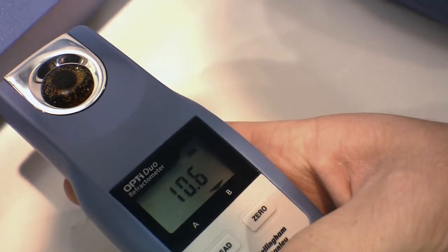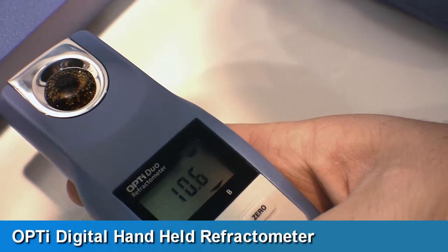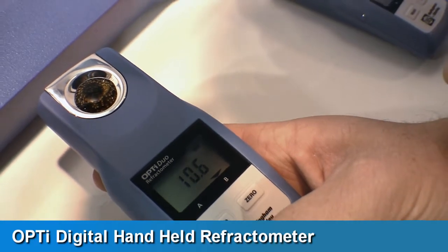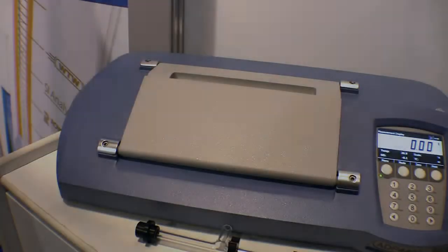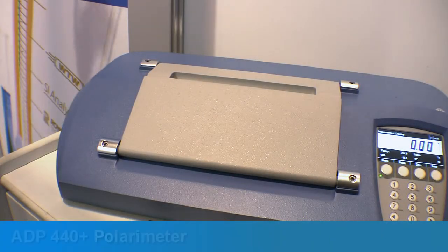Also on show is the OptiDigital range of handheld refractometers used in food and beverage, life science and industrial environments, and comes in single and duo scale versions. And finally, the ADP440PLUS polarimeter was another popular item.